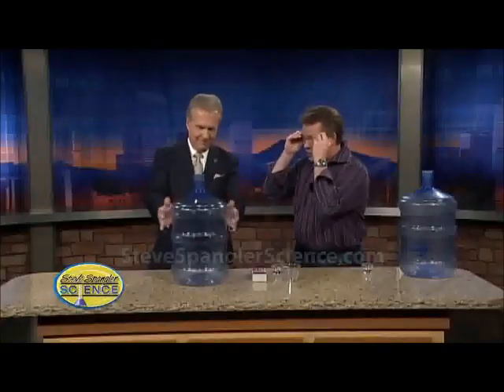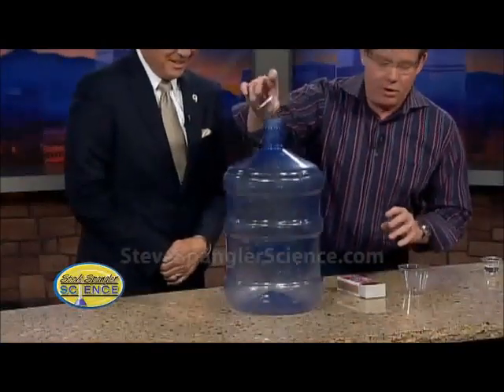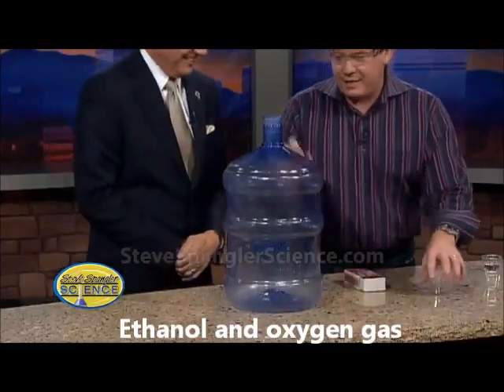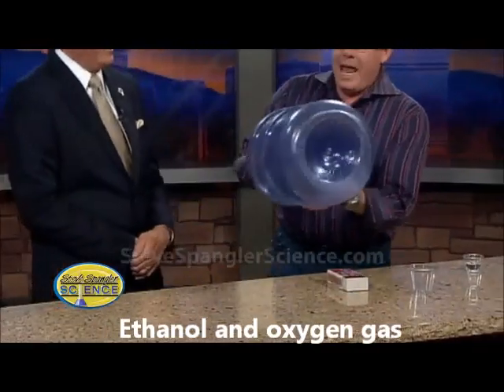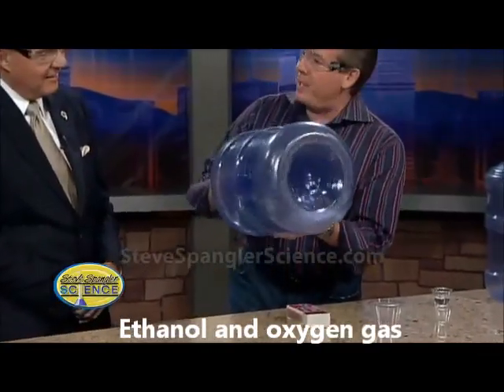We're going to let air do this for us. Put on your safety glasses because you get to now deal with not only fire but a flammable liquid. We say don't try this at home. I have a flammable liquid here — it's actually ethanol. What I'm going to do is spin this around so that we can get it to evaporate inside.